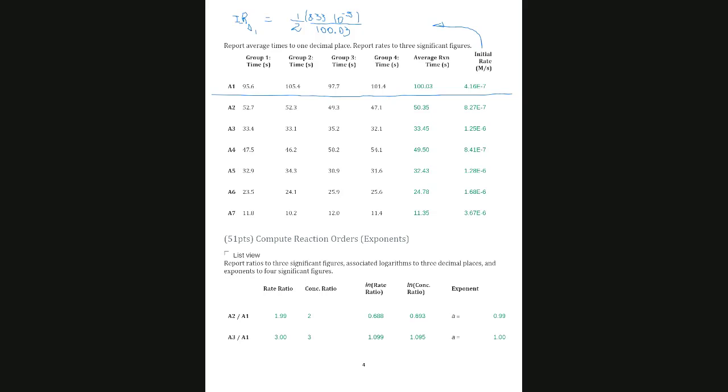I have a question. Yes. Do we only use S2O3, or do we use any of the other ones? Like, do we use the iodide or the hydrogen? We are going to use everything because I didn't finish. The thiosulfate, we only use it to calculate the initial rate.